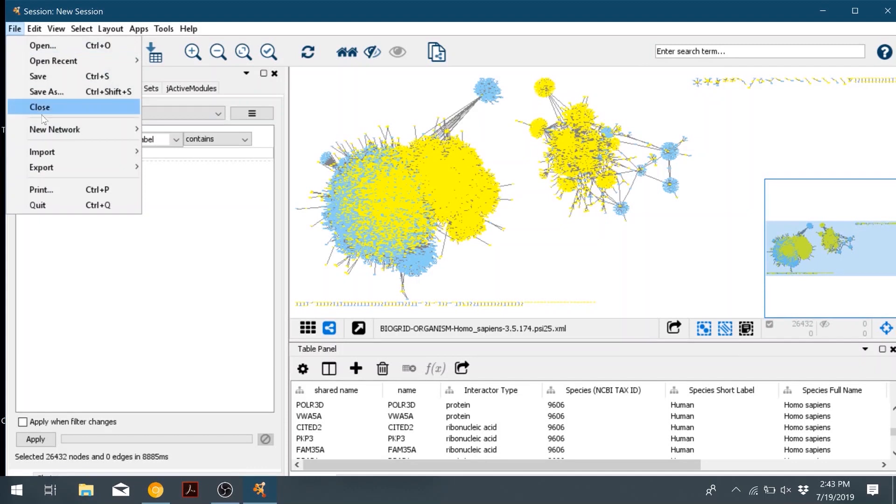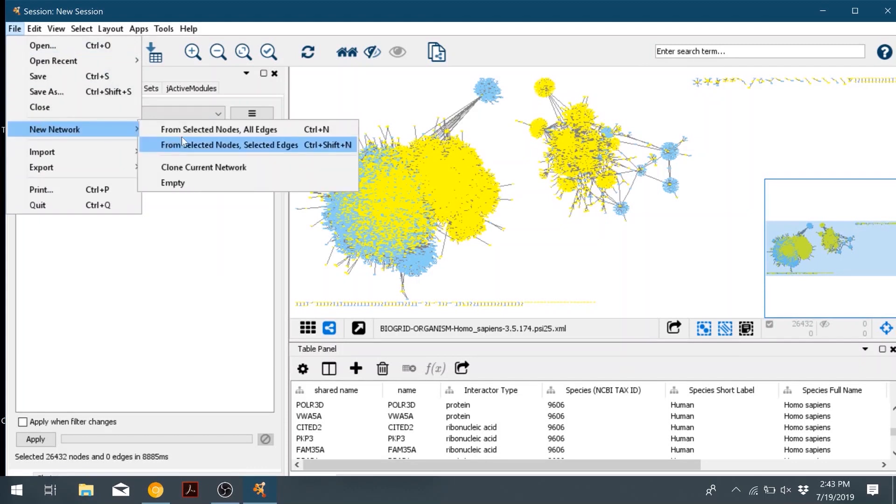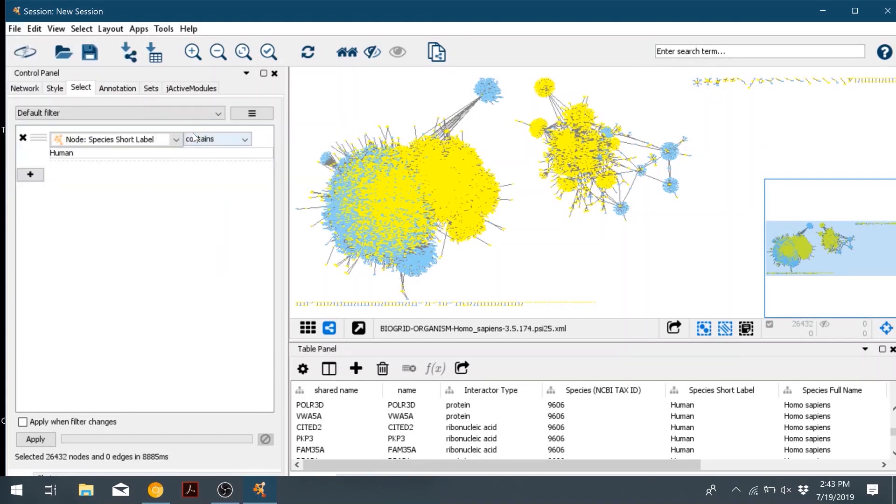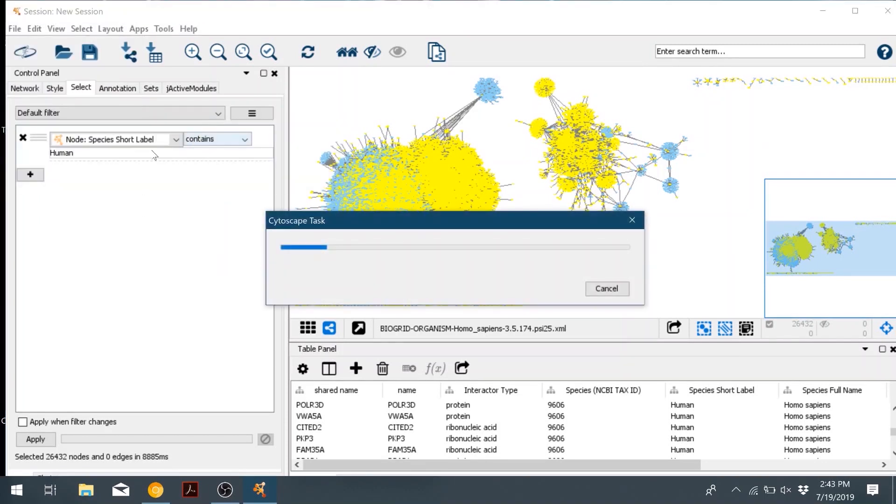We'll go to file, new network, from selected nodes, all edges. So this will create a new network with just all the human and HPV nodes.